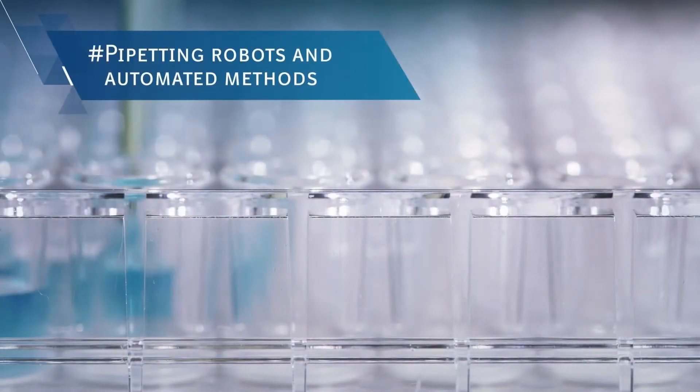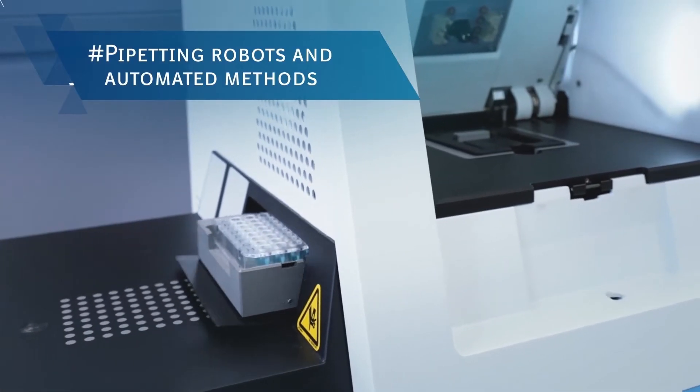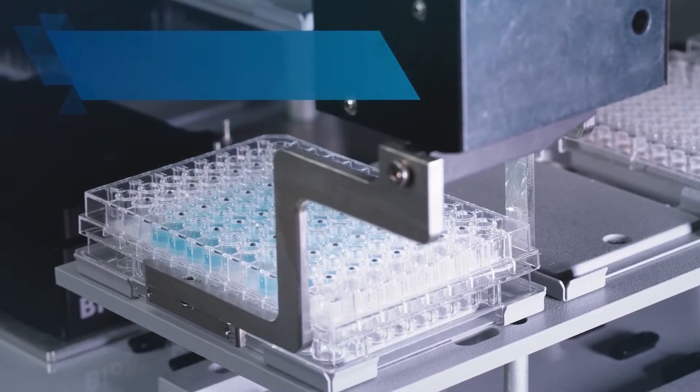Pipetting robots and automated methods analyze enormous volumes of samples and enable the derivation of digital benchmarks.